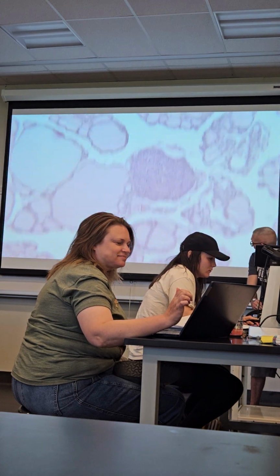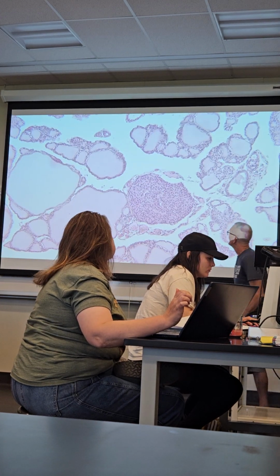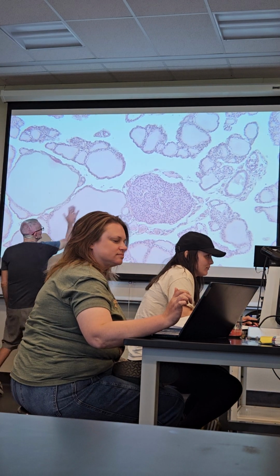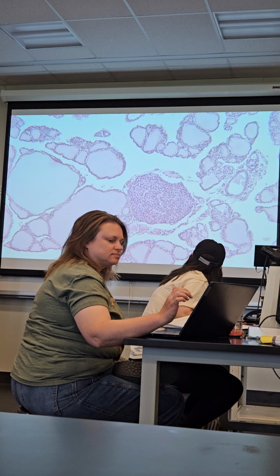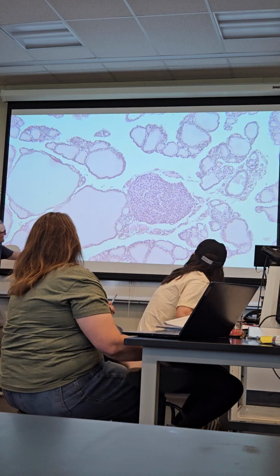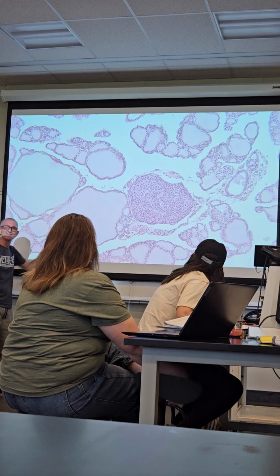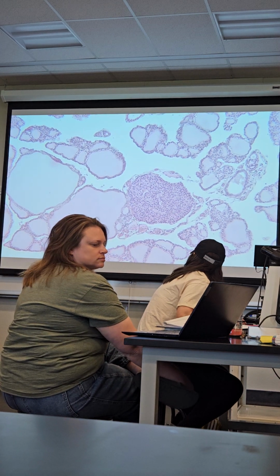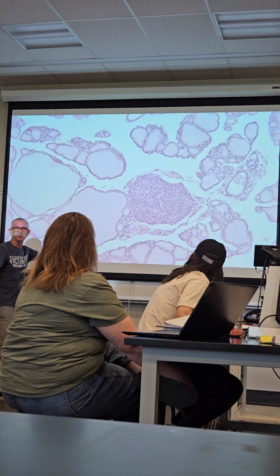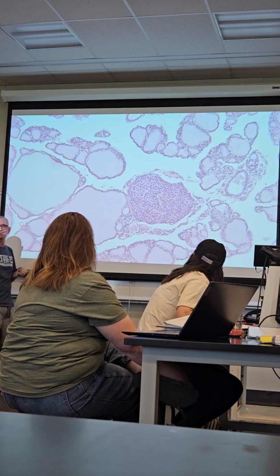Beautiful. Much better, right? What's this? Parathyroid. What's this whole thing? Colloid. Well, the whole thing, the entire thing. Thyroid follicle. Thyroid follicles equal follicular cells plus colloid, right? Correct. So if I want the entire structure, I want the follicle. If I say name the substance, colloid. If I say name the cell, follicular cell.